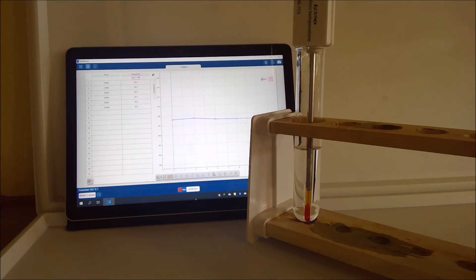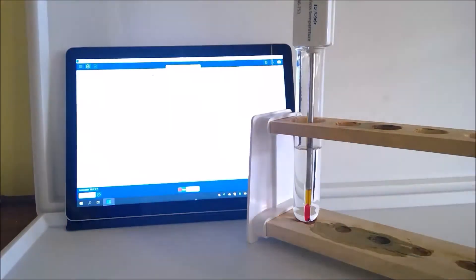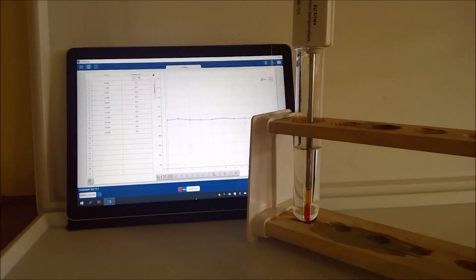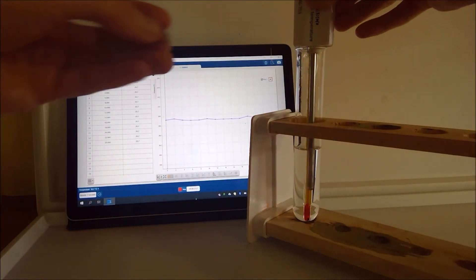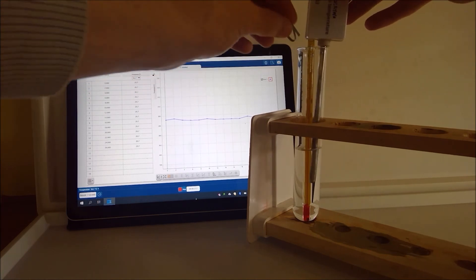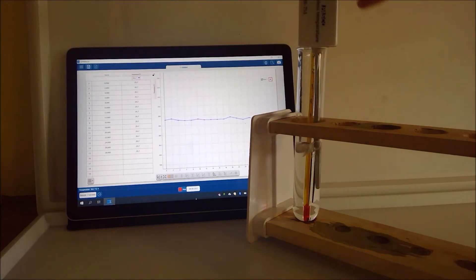And so we can see that just up on the screen there so we can see what's going on. Then we're going to put in our piece of magnesium ribbon. Now magnesium reacting with hydrochloric acid you might like to think about what you might observe and then you can see if your prediction is correct and we will monitor the temperature change as well. So we've got that initial temperature down already so pop this in.